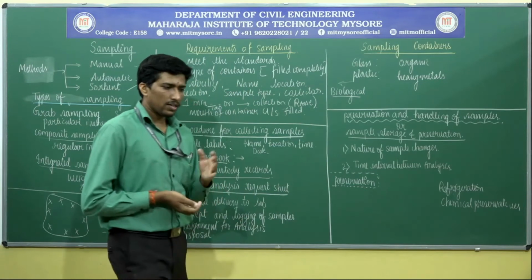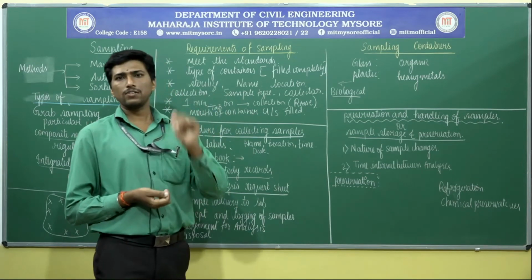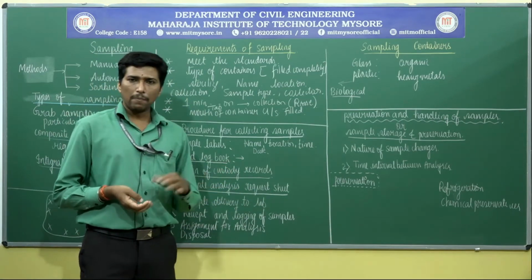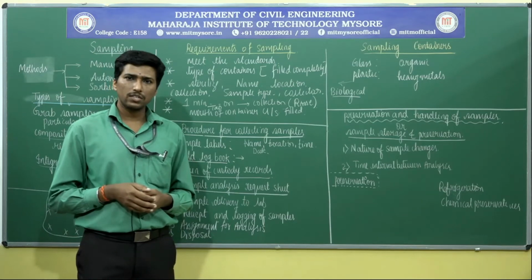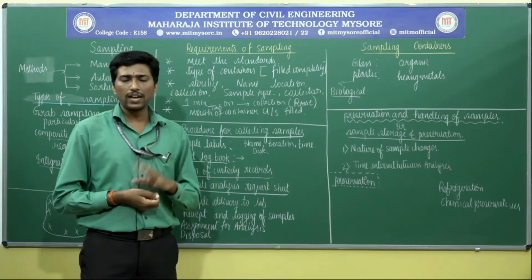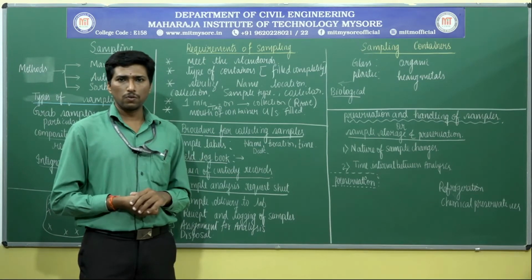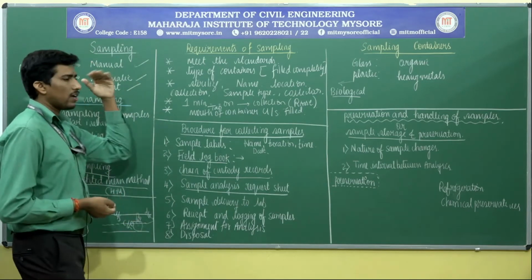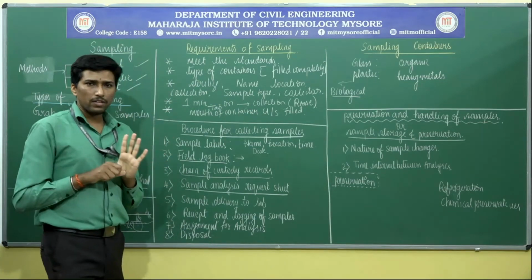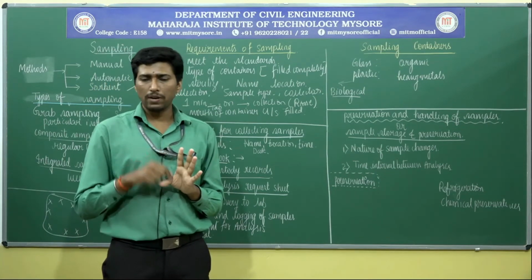I don't know the nature or quality of the water, or the wastewater, that I am sending to the laboratory, so I need to have a requisition sheet stating who the person is and what the nature of the problem is. Source identification is very important for environmental monitoring and analysis, and even for pollution control, because the first thing in environmental engineering laboratories is to determine whether the water quality meets the compliance standards.